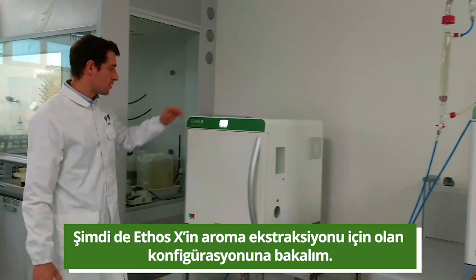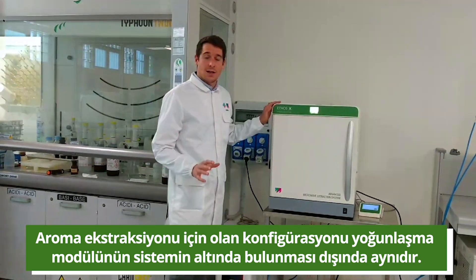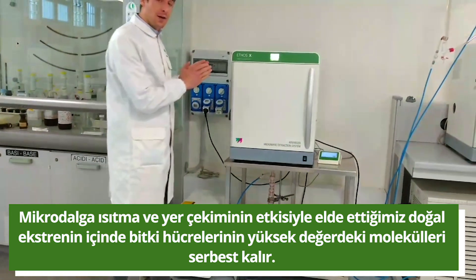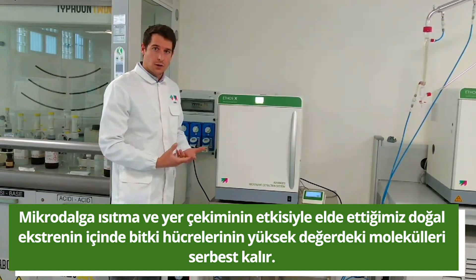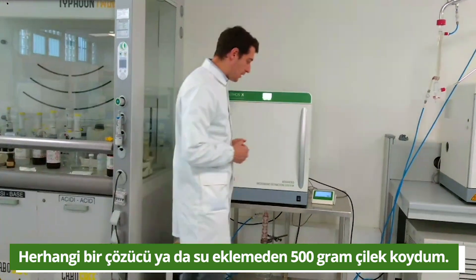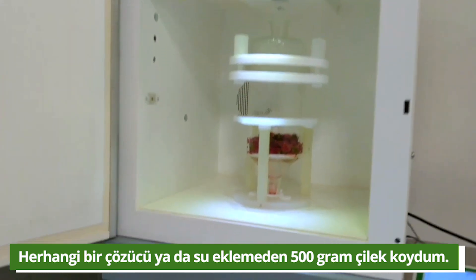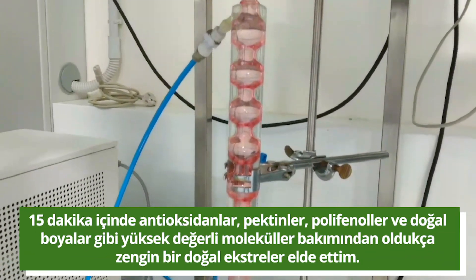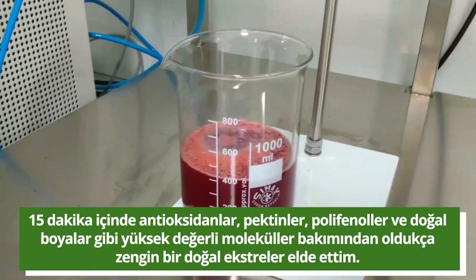Now let's move closer to the flavors configuration. The ethosX system for the flavors configuration is basically the same; what changes is the condensation module which is placed on the bottom of the system. The combination of micro-reheating and gravity allows the plant cells to release high-value molecules inside the natural extract. In this case I loaded the cavity with 500 grams of strawberries without any added solvent nor water, and within 15 minutes I obtained a natural extract enriched in high-value molecules like antioxidants, pectins, polyphenols and dyes.